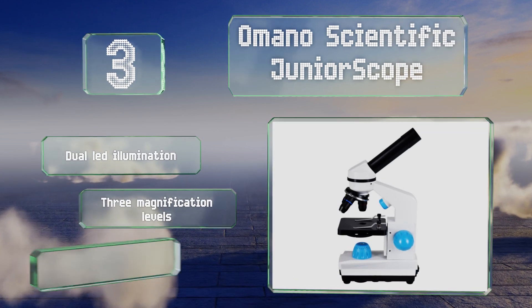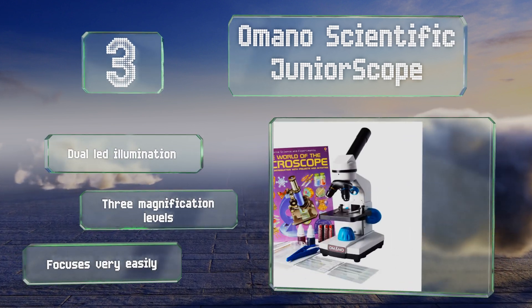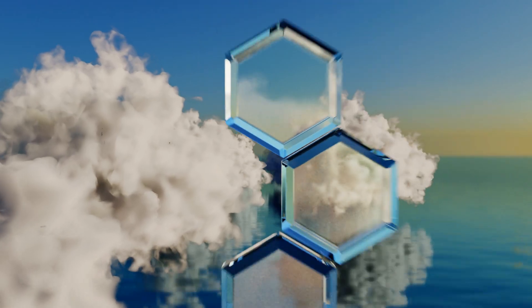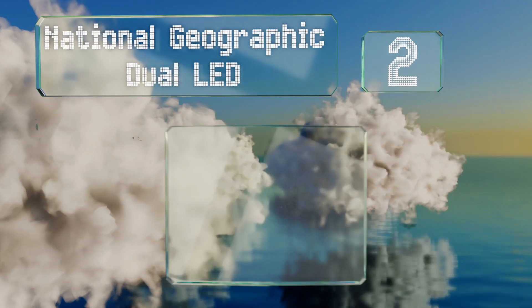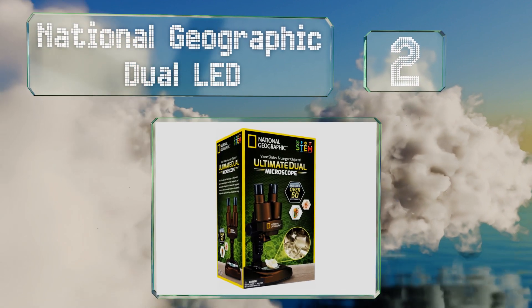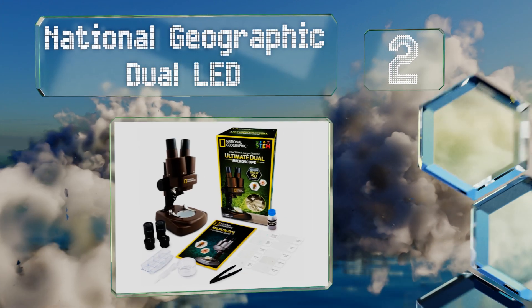The Omano Scientific JuniorScope offers dual LED illumination and three magnification levels, and it focuses very easily too. At number two, created by one of the most recognizable names in science, the National Geographic Dual LED is a versatile model ideal for studying objects under direct light or for looking at specimens floating on the bottom of a petri dish.